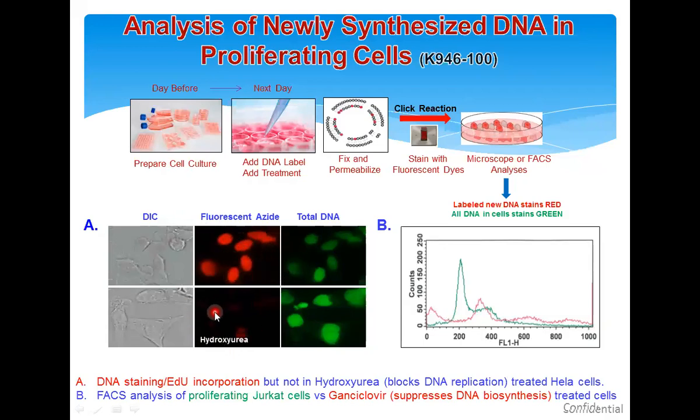But with hydroxyurea, which blocks DNA replication, and this is in HeLa cells, you see it blocks DNA replication. You don't see the click reaction here because EdU is not incorporated, since there was no DNA replication here. But this is the newly synthesized ones. But cells are here.